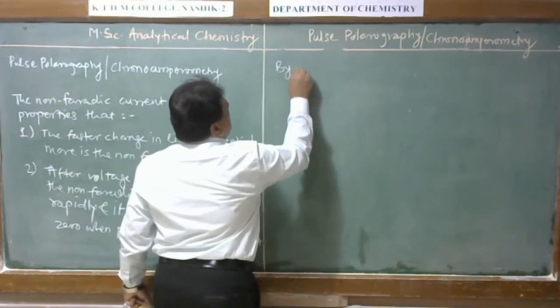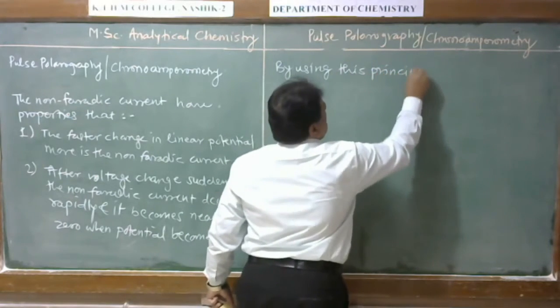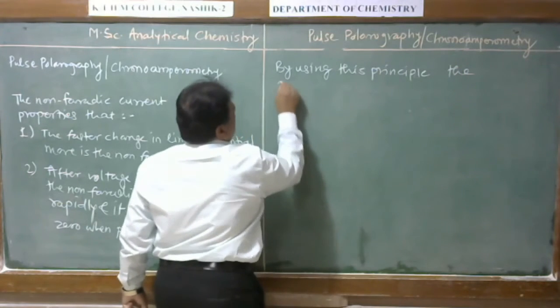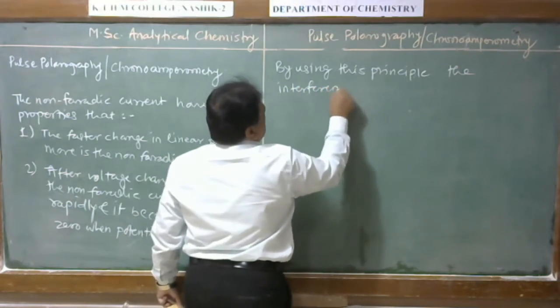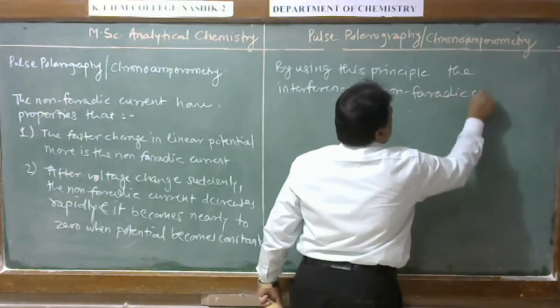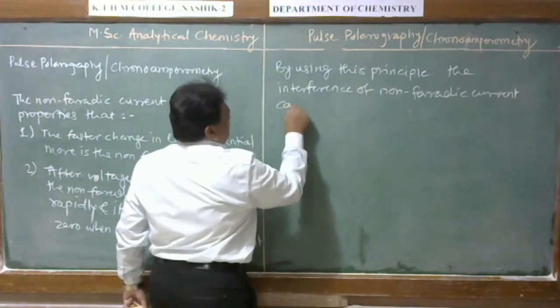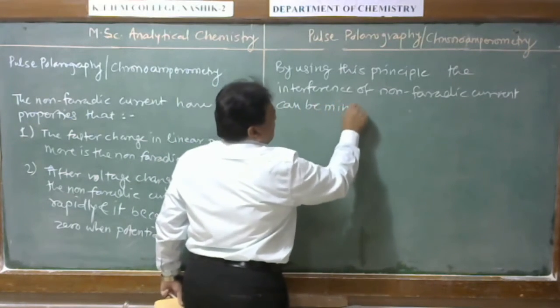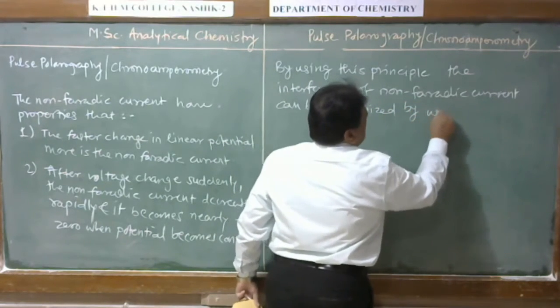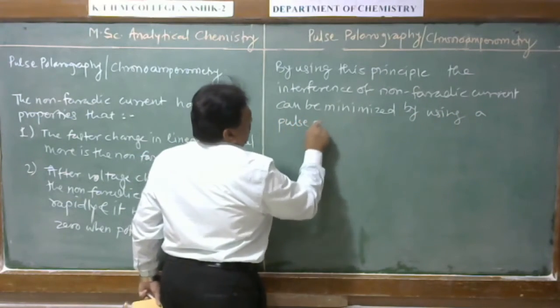By using this principle, the interference of non-faradic current can be minimized by using pulse polarography.